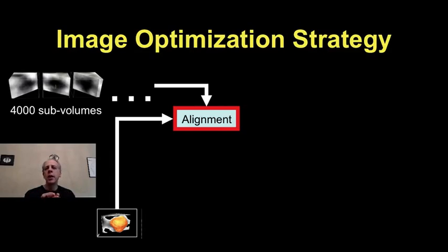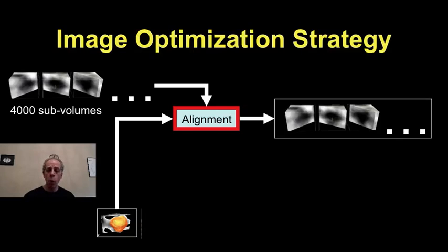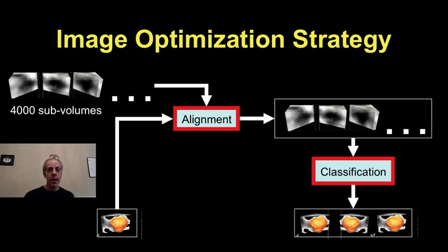You can actually only, if you want, align those that basically put a very, very high threshold and very high level of confidence in the alignment. You say, I'm going to align only those that, after I align, the distance is almost zero. They're almost identical. So then I have more confidence that I have done good alignment. Once again, alignment is you start and just rotate them until the distance that we showed in the previous slides becomes the smallest possible. Once you have them aligned, then classification becomes a bit easier.